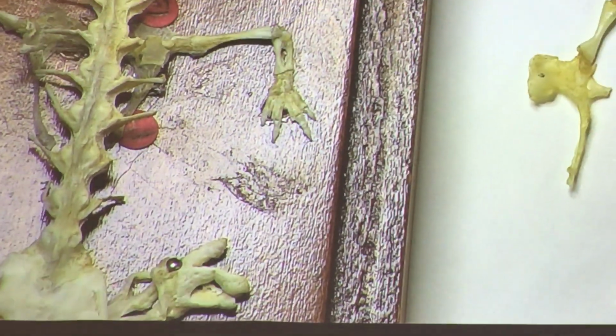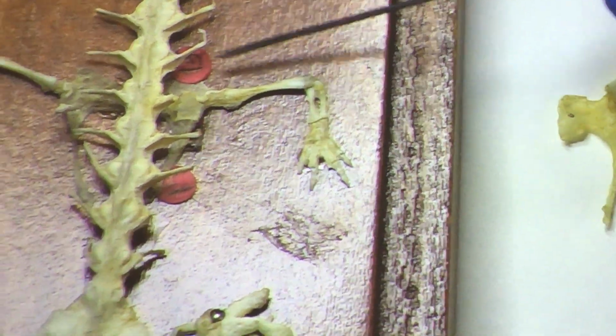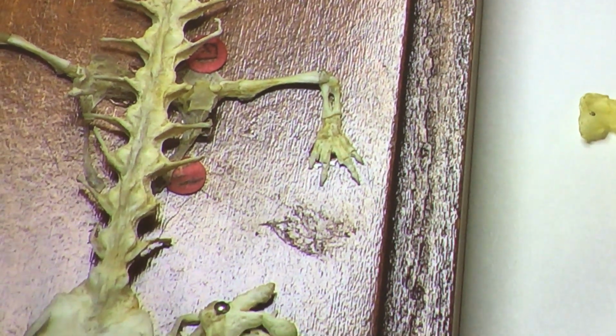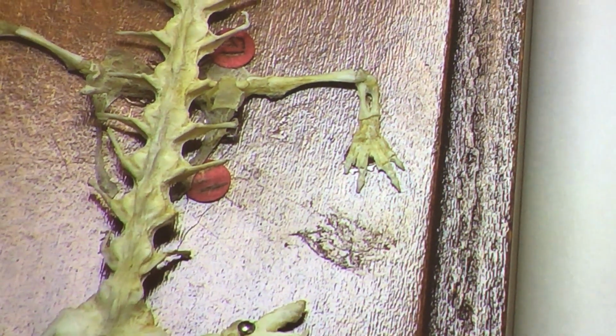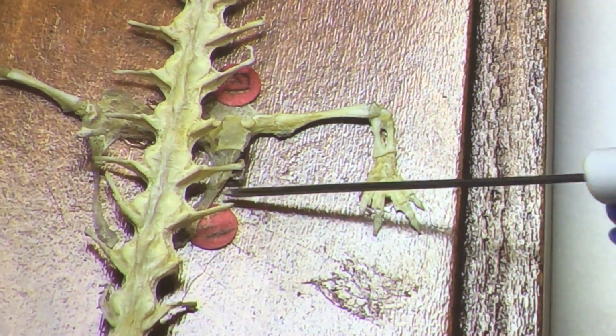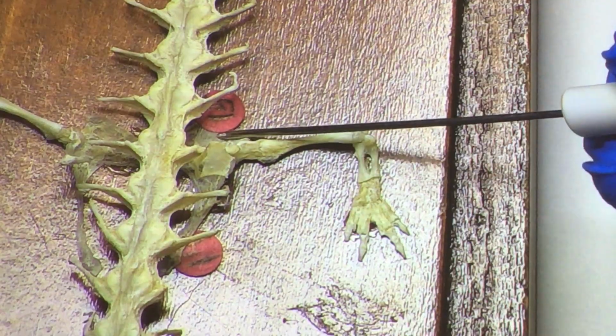So, it's going to be a little different than you. Some of the stuff will be the same, but some will be different. So one thing is most of the pectoral girdle, much like most of the pelvic girdle, is cartilage, not bone. We got this plate here, which we can see here. It almost looks like if you were wearing armor, the pec plate you put over your chest. That's the coracoid plate. Running cranially from it towards the head is the procoracoid. So we have our procoracoid, number 14 on the old test, number 15 was the coracoid plate.